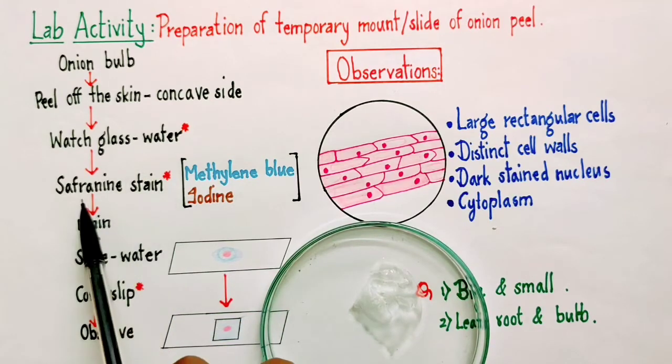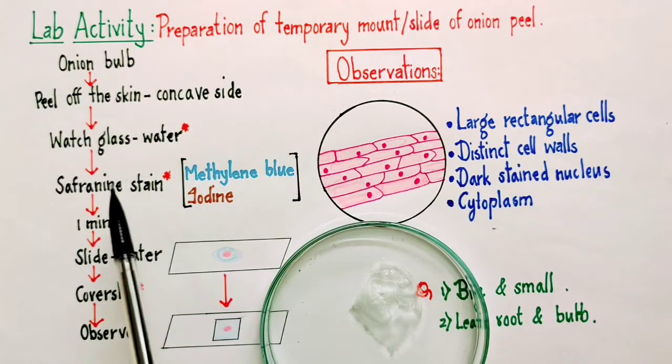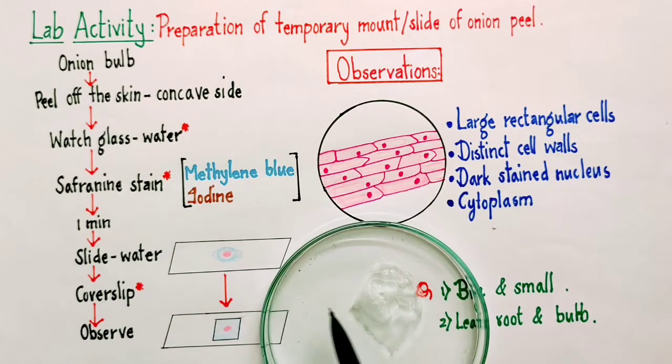The moment you add a drop of stain, after that you need to gently mix it and wait for about one minute. This time is important because we want the cells to take the stain. However, we should not allow over-staining of the cells also.